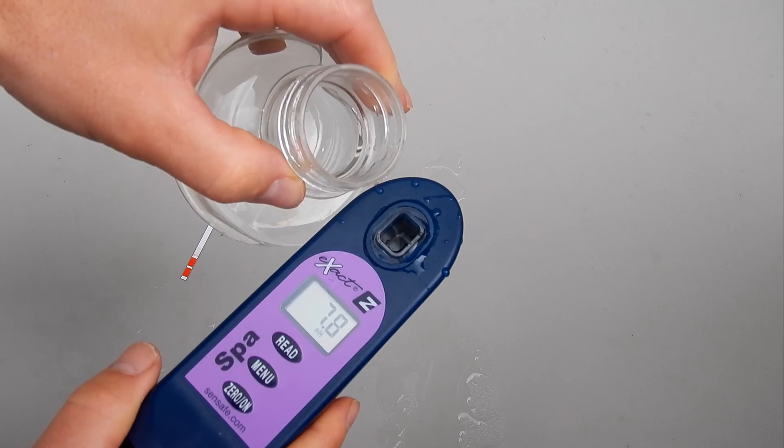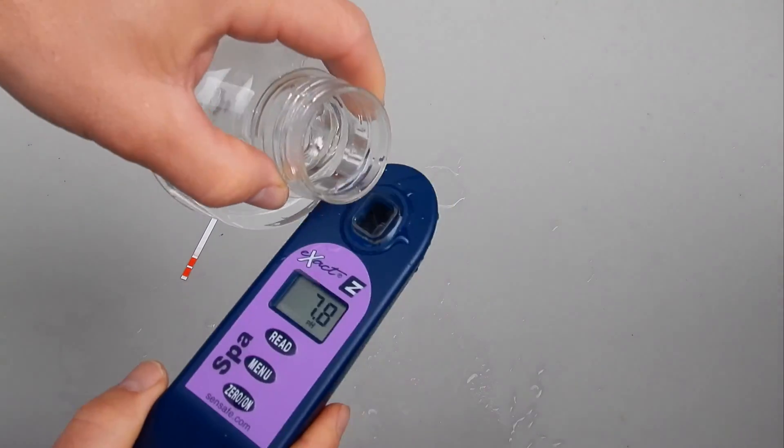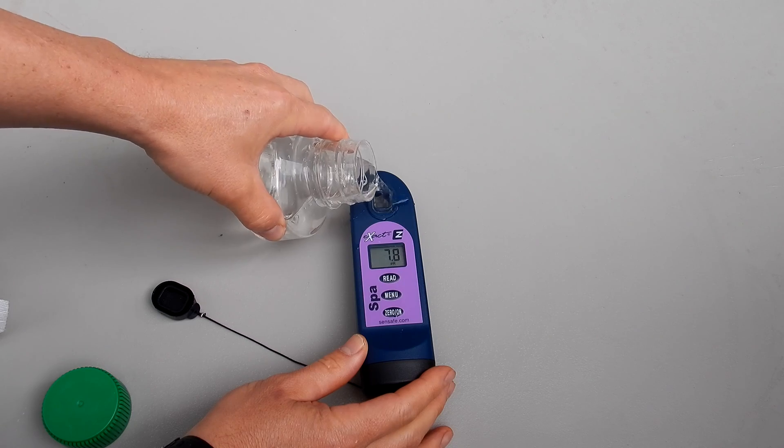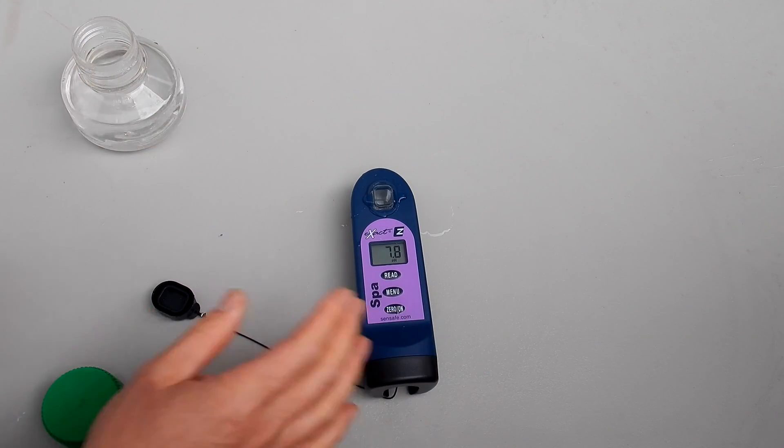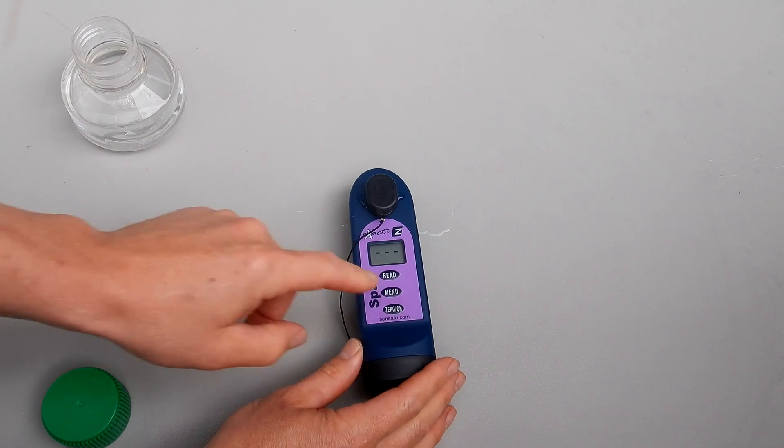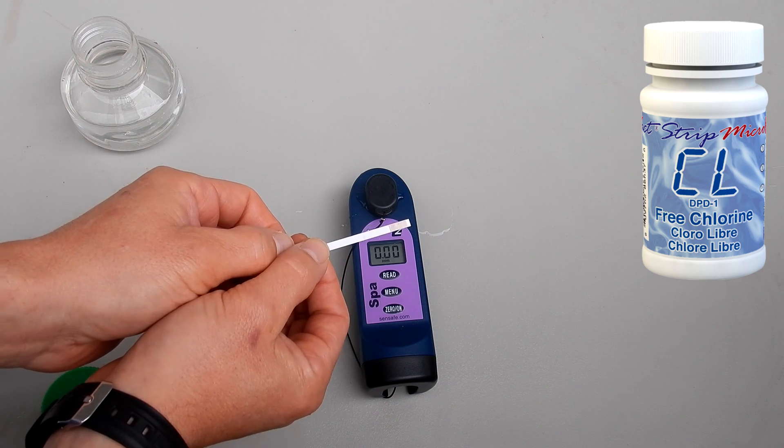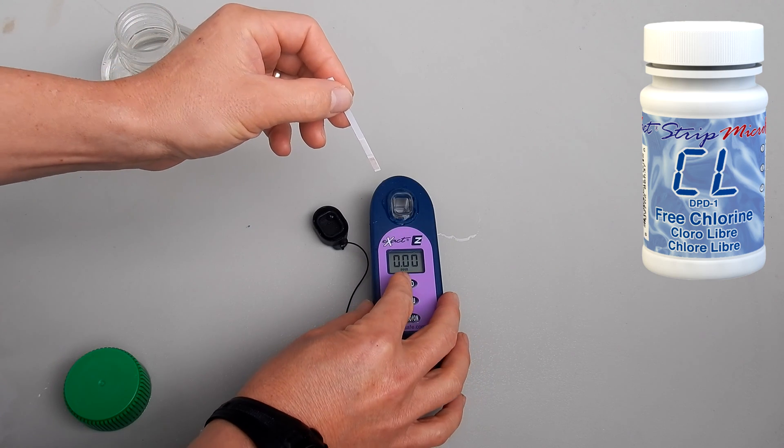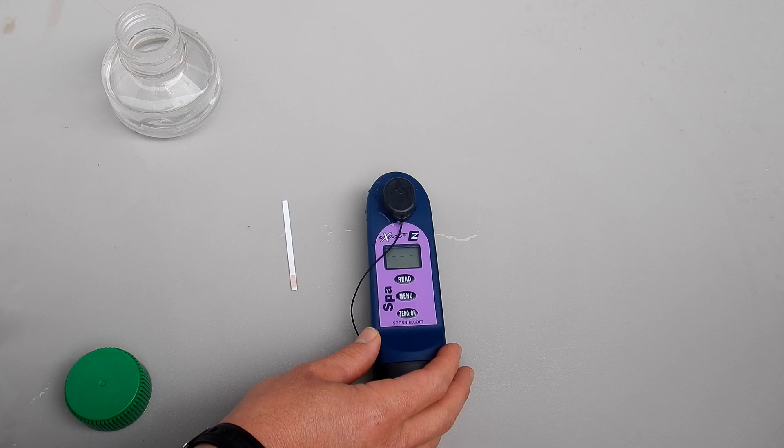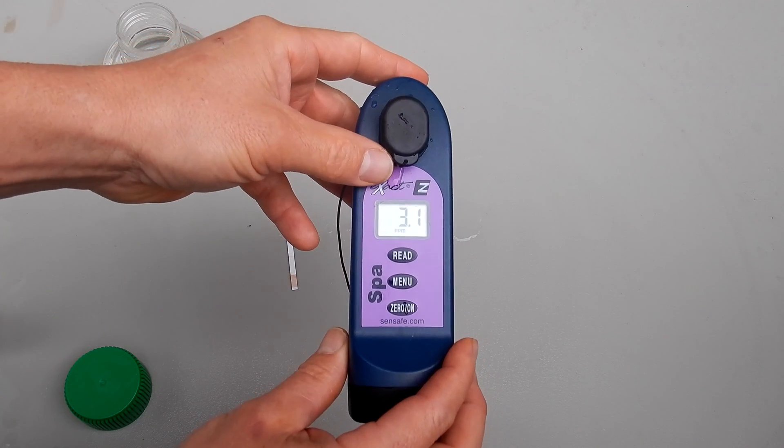Again you want to rinse the chamber out thoroughly in between testing. You go ahead and use the included brush to scrub it out. Let me go ahead and do the free and combine chlorine test here for you. Let me zero it out. You'll use the CL DPD-1 test strip. You want to hit the read button. I'm going to move the strip back and forth inside the chamber. The chlorine is coming in at 3.1 parts per million.